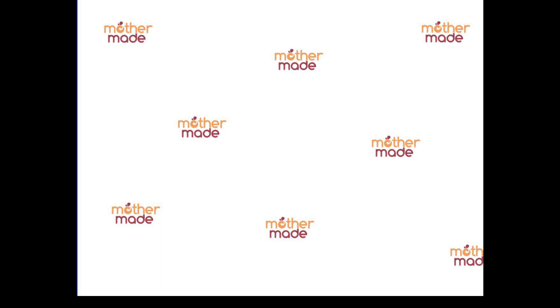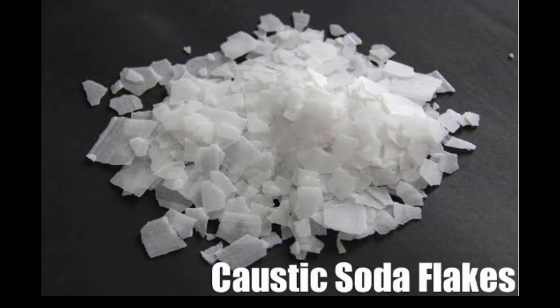A lot of heat is produced after this reaction and the vessel becomes very, very hot. One more critical safety point: always add caustic soda into water — take the water first, then mix sodium hydroxide into it. Never add water into sodium hydroxide, otherwise it can blast.